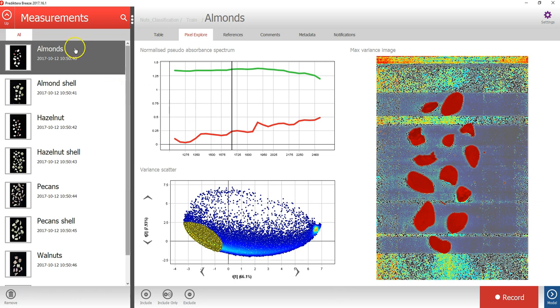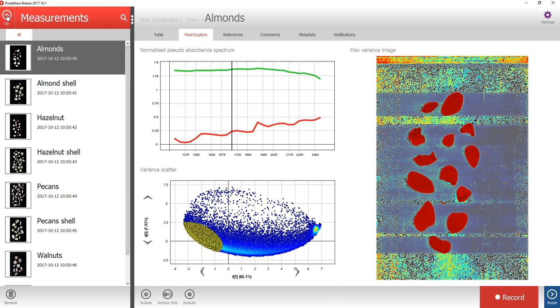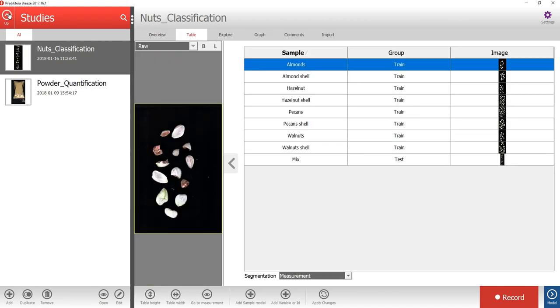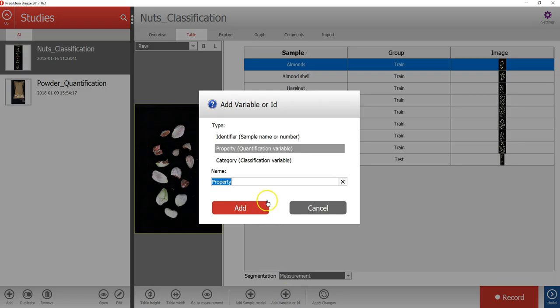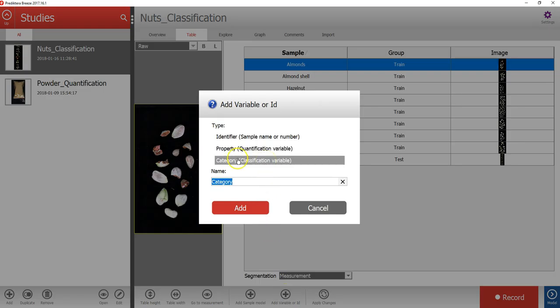Let's press the up button in the upper left corner to return to the group level, and then again to go to the study level. Now let's enter the reference data for the training samples, which is the class type variable. To do that, you will first press the Add variable or ID button under the table. Then you will select the type of variable, which in this case is a category or classification variable, and then write the name.